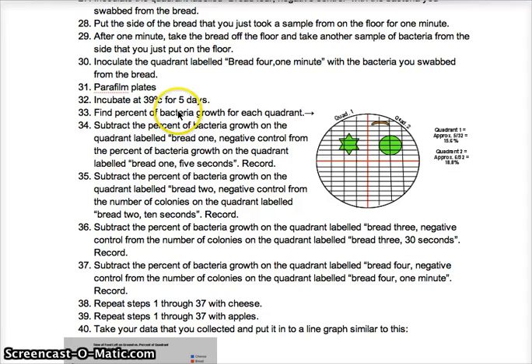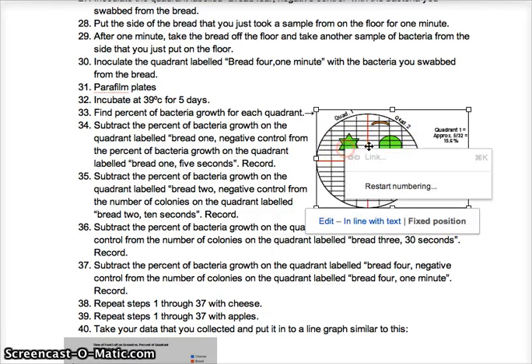at 39 degrees Celsius for 5 days. After that, you will take them out and make observations. You will see how much bacteria is on the surface area of the quadrant of the plate. You will determine the rate of growth by the amount of bacteria on the quadrant.